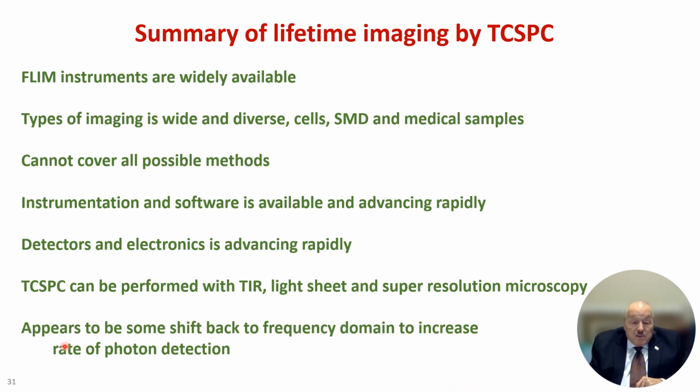And a surprise to me is there seems to be some movement back to the frequency domain method to increase the rate of photon detection. The reason FD has not been used very much so far is because the CMOS detectors are really static detectors, but methods are being developed so you can collect images over short periods of time, and we'll discuss those in the next section.